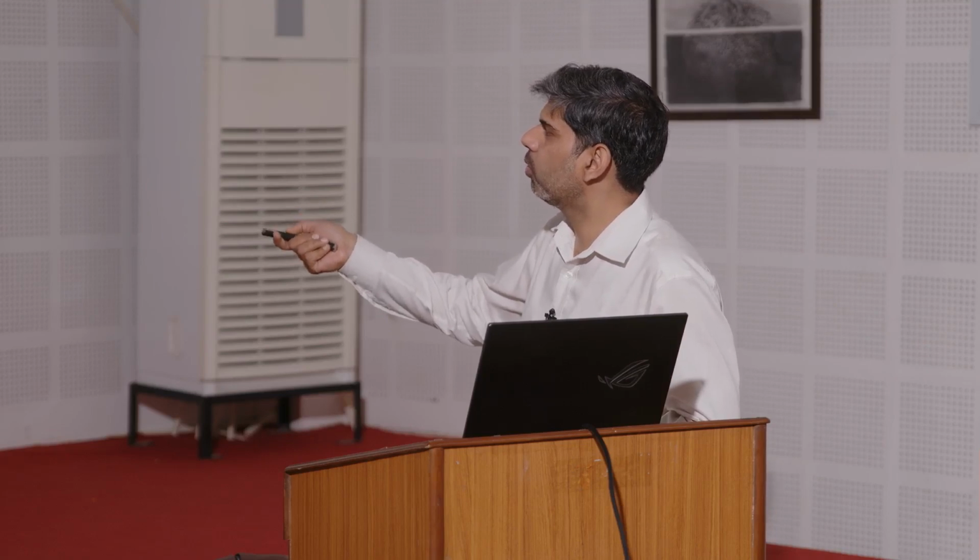So, my resolution scales as the difference in the mobility times the electric field, and you have time and time cancels, and you have the square root of time over the square root of 2 times diffusivity. This is just a scaling, this is not the exact value.